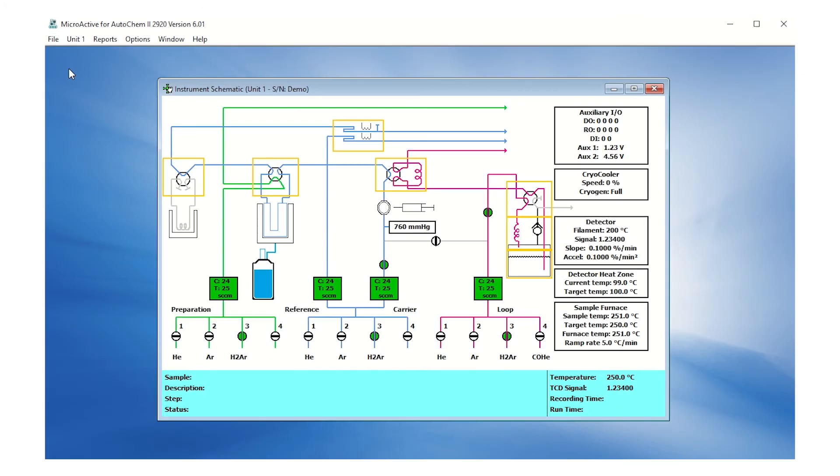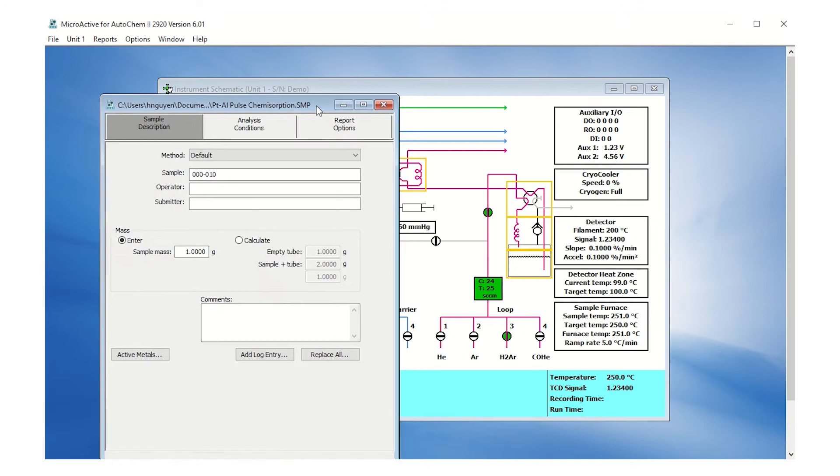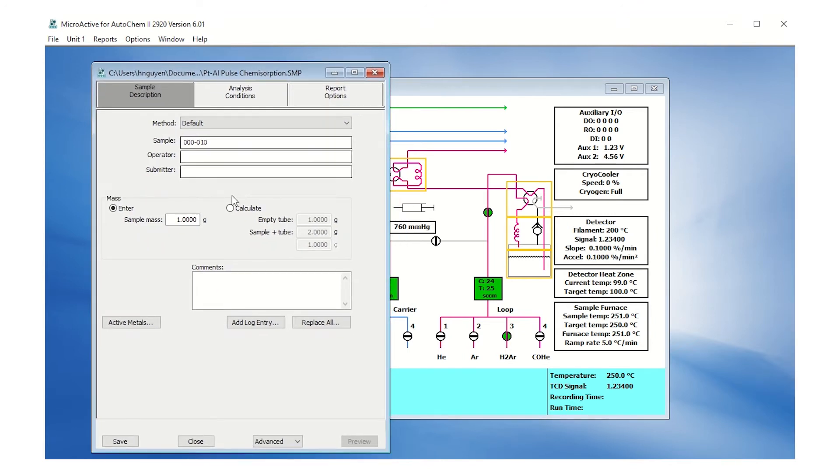Open a new sample file in the microactive software by clicking File, Open, and enter the name of your choice, and click Open. Click OK when asked if you wish to create a new sample file. Type the empty tube mass and sample plus tube mass.